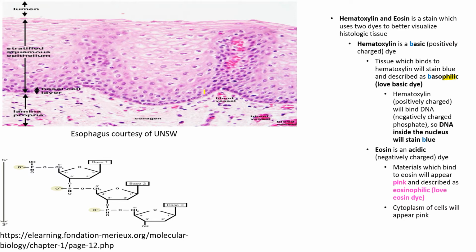Here's a better example. We can appreciate the nucleus as well as surrounding cytoplasm.